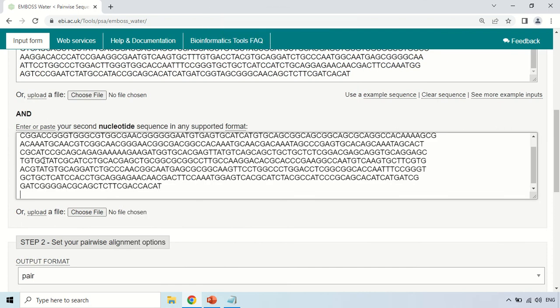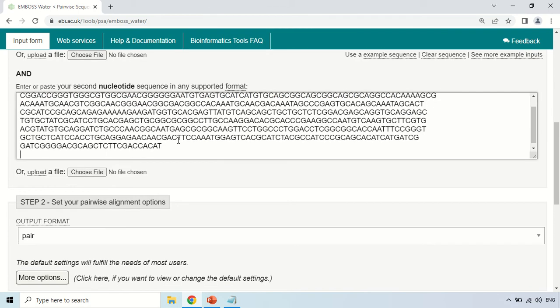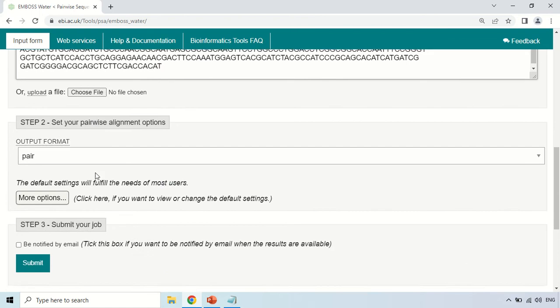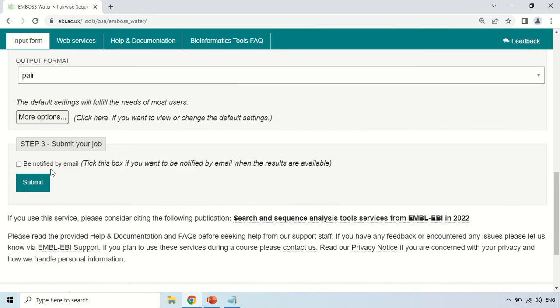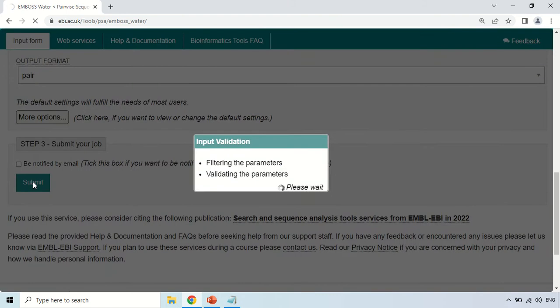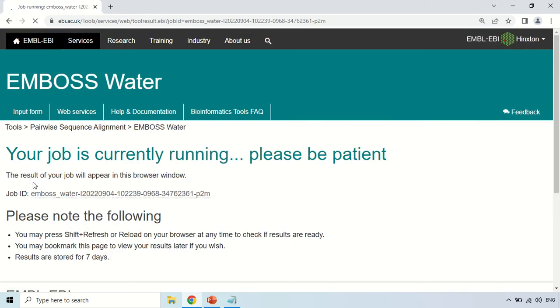You can also upload the file of your second sequence by choosing a file. The output format is pairwise alignment. There is also an option to be notified by email — you can click there and enter your email so the result will be emailed to you. After that, click on the Submit button.